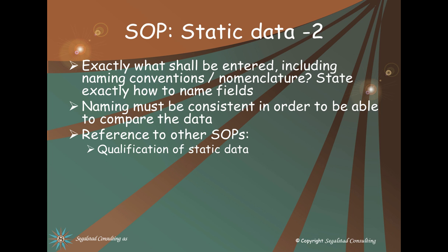And I can tell you that when I implemented a LIMS system in the late 80s in the company that I used to work for, we realized that there were 12 different ways of writing weight percent. 12 different ways. As readers, we understand that the W's before or after percent, or upper or lowercase, or even space or no space between the W's and the percent are the same, but the system does not.